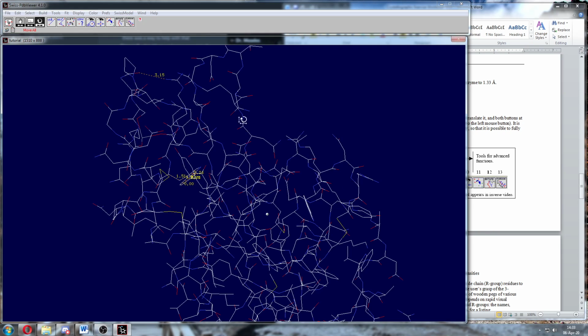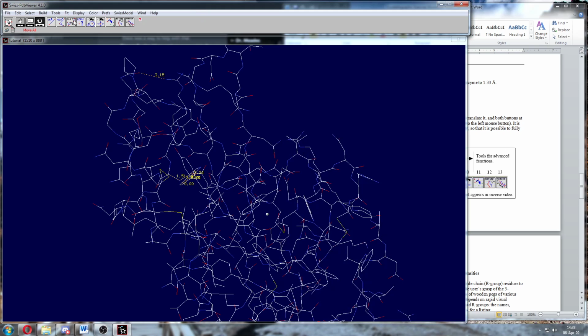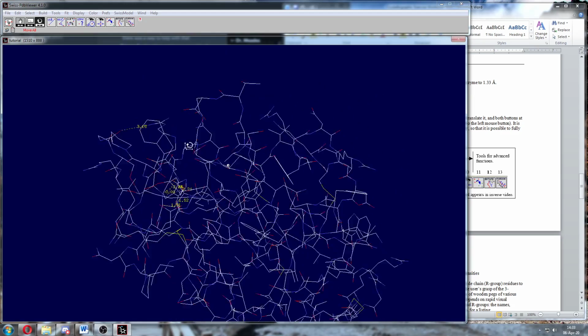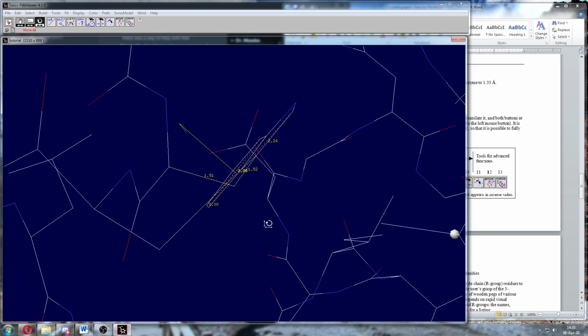The other is this number 8 in the example here. It says a dot with a question mark next to it, and then there's this Lu41 written above it. Right? And the Lu41 is just a label. So this is a labeling function. So going back to our tryptophan one more time. So there it is again.